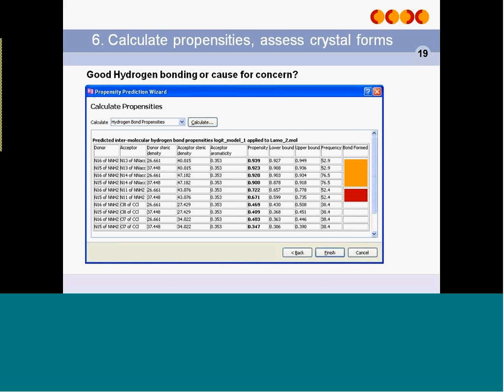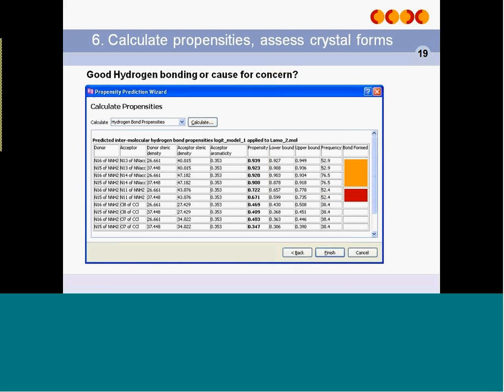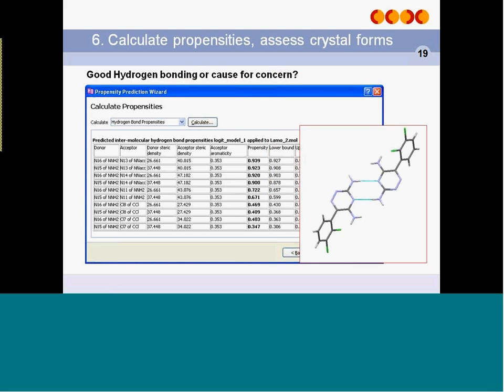And if we look at the solid state, the crystal structure for the lamotrigine, what we find is indeed this interaction that we've predicted here is occurring. We've got these NH2s donating into the aromatic nitrogen, and also the second interaction here also occurs. So again, NH2 donating to the other aromatic nitrogen. And so if this were a drug development scenario and we had this sort of prediction matching up with our solid form, we'd be feeling fairly confident that what we had was a good candidate.